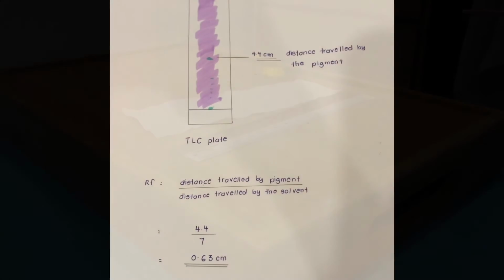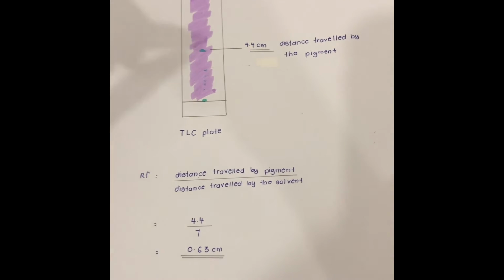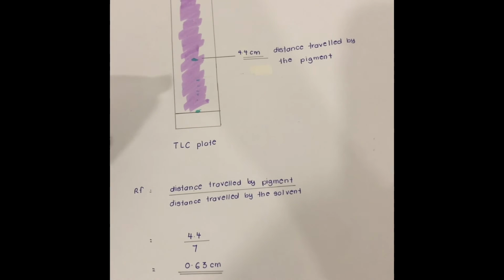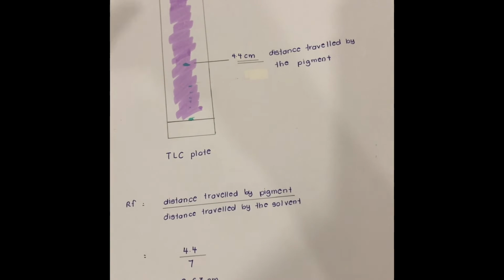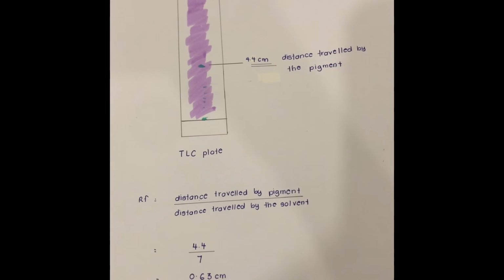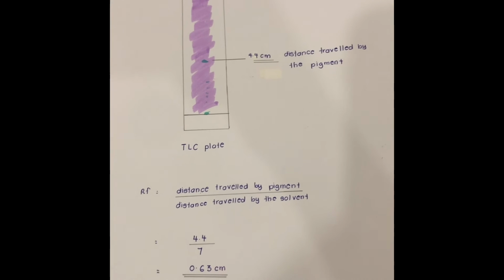Thank you, madam. So this will be the last part of my video. I'll be calculating the RF value. This TLC plate is actually based on the results that I obtained yesterday. So the results that I obtained yesterday was the distance traveled by the pigment. It was not very clear, but when I did measure it, it traveled approximately 4.4 centimeters, and the distance traveled by the solvent is about 7 centimeters.